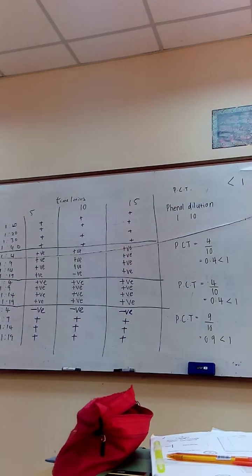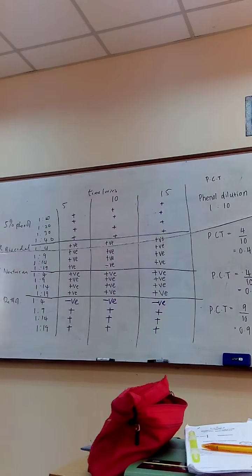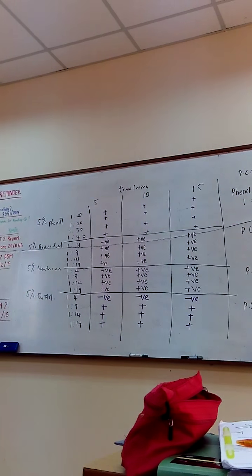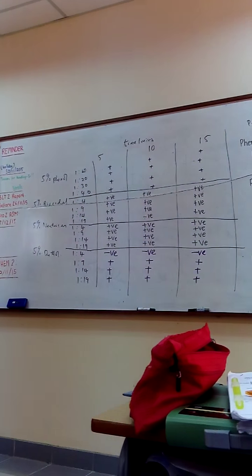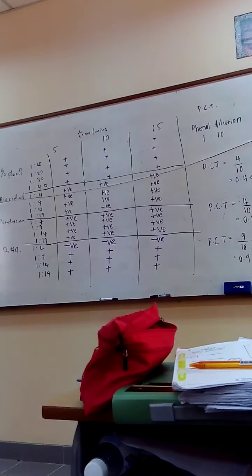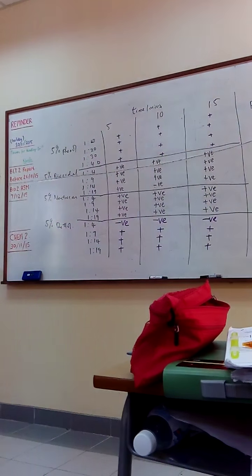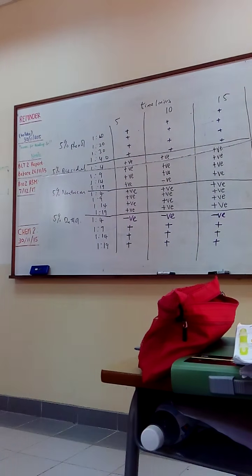What do you mean phenol is the best? Phenol is the standard. Yes, say all are positive, because we are using 5%. If you want to increase it, it should be negative, right? I mean, if it is negative, that means it is effective. Yes, but that one is 5% only, less reliable, right? You're talking about the biocidal? Yes. When we compare with Dettol, there is mostly negative, or all positive. Isn't Dettol more effective than phenol?